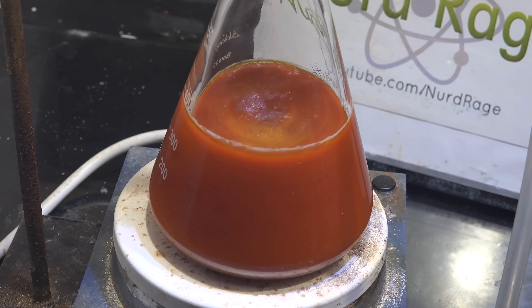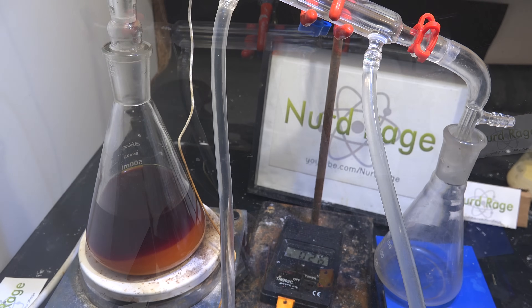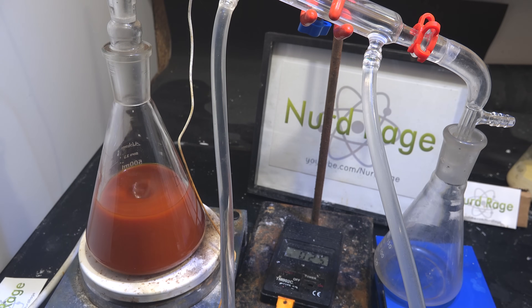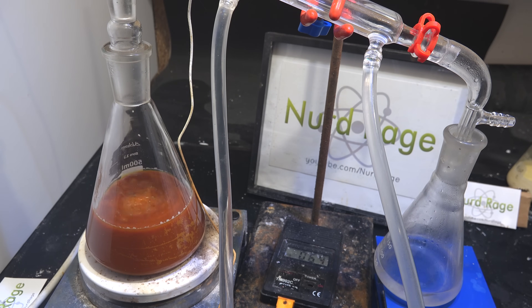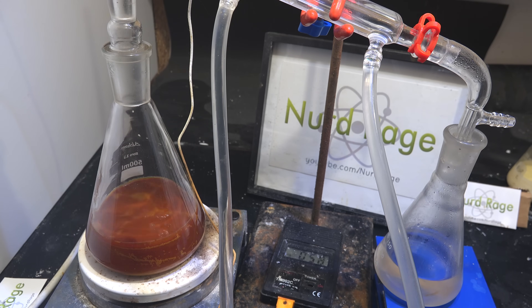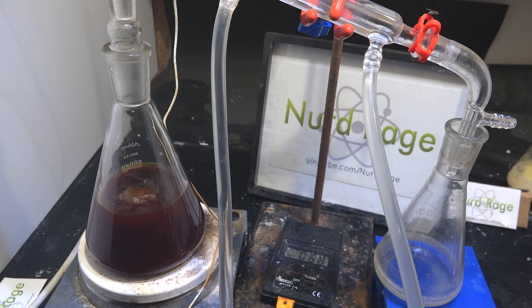Now we start the complicated process of separating out the pyrimethamine. Take off the reflux condenser and assemble a distillation setup. Distill off about 100mL of liquid — I want to add water later but I'm worried about overfilling the flask, so I'm removing some solvent first. I'll be honest — I'm making up this process as I go, working only from my own years of lab experience. Turn off the heating, add 100mL of water, then turn heating back on and keep boiling off more solvent — essentially replacing the organic solvents with water.